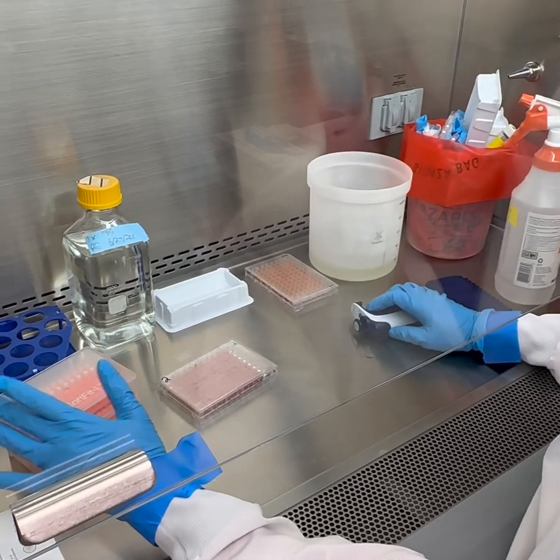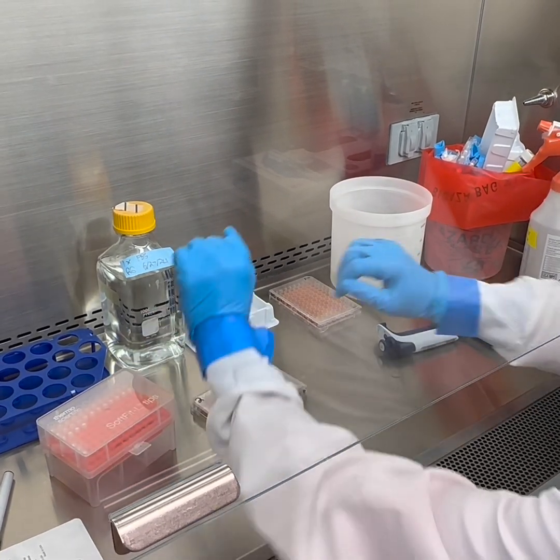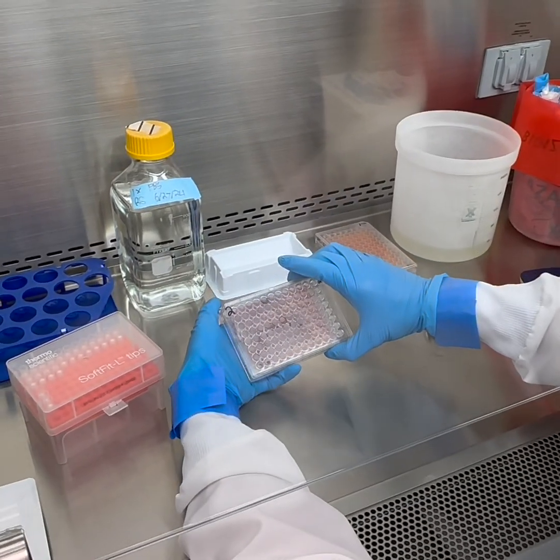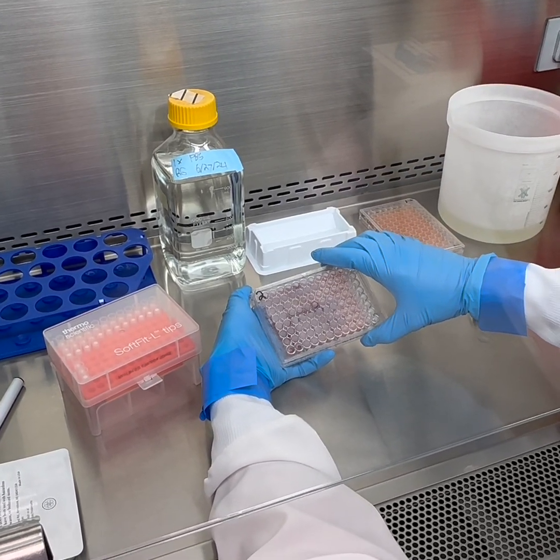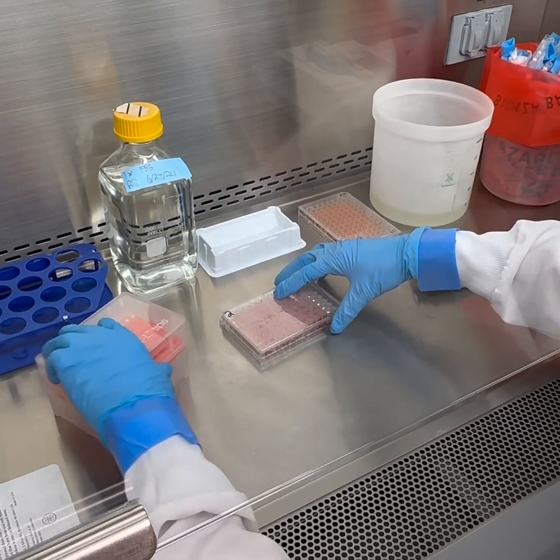Okay, so now we've done our 2 to 3 hour incubation with our XTT. You should be able to see a gradient, but we did 3 hours, and so this may be maxing out. But we'll see under the plate reader what it says at 490 nanometer OD.